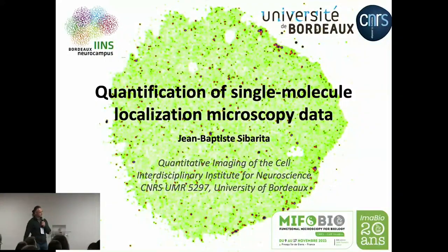So I'm supposed to close module 2. The last presentation of the SuperRes course was asked to give a talk on the quantitative aspect of single molecule localization microscopy. It's not very easy. We had very, very beautiful presentations from different speakers, going from probe developments and microscopy developments to beautiful applications of SuperRes. But still, the quantitative aspect has not been explained, so this is my goal here.